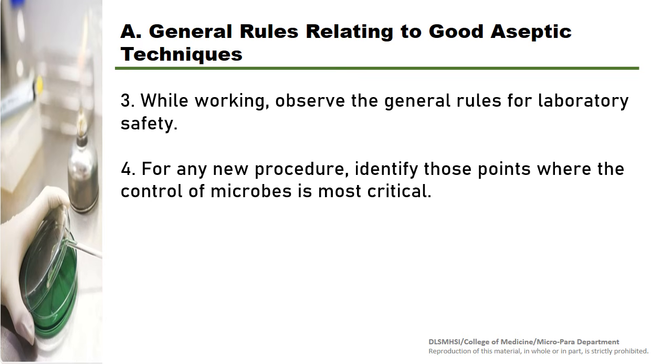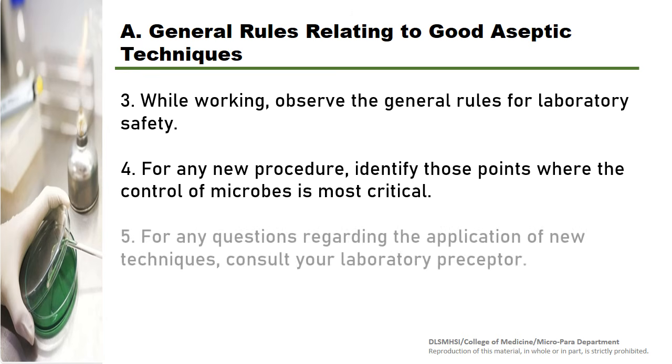For any new procedure, identify those points where the control of microbes is most critical. Now, if you have some questions or you need some clarifications, do not hesitate to consult your laboratory preceptor.